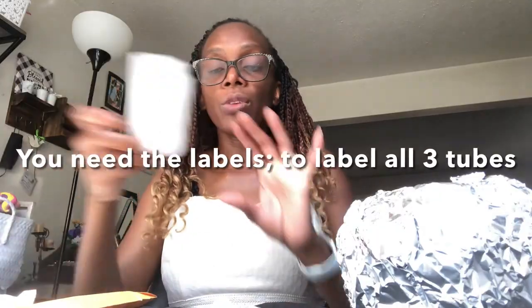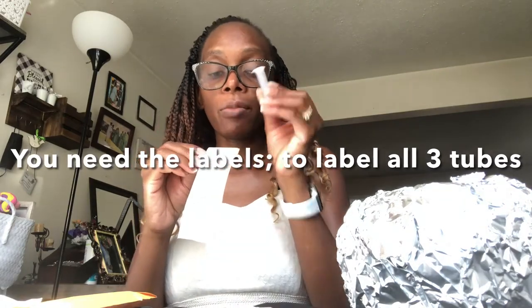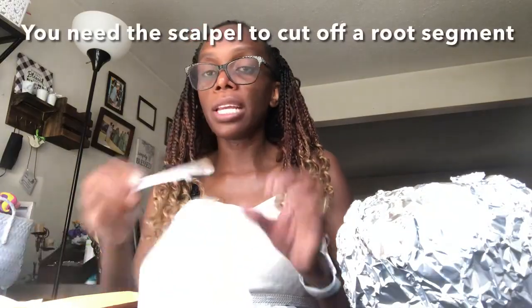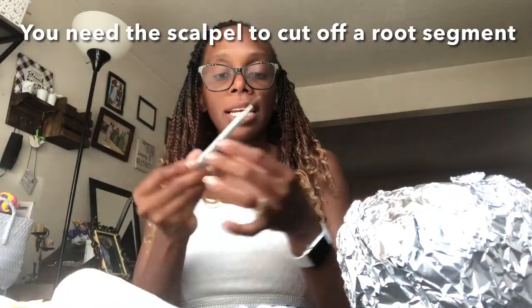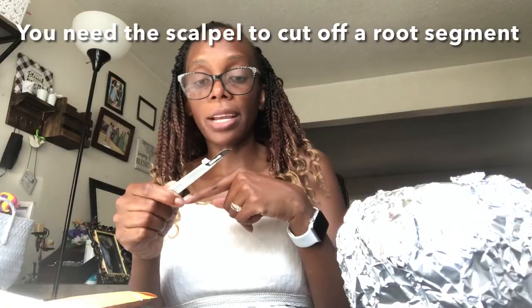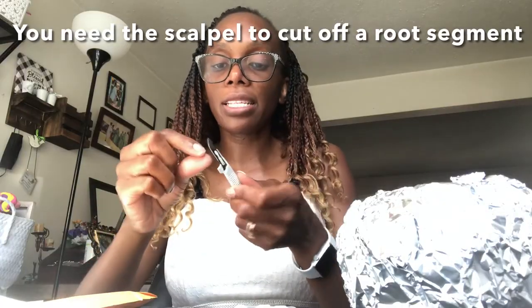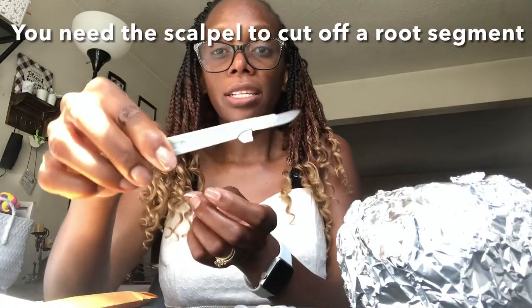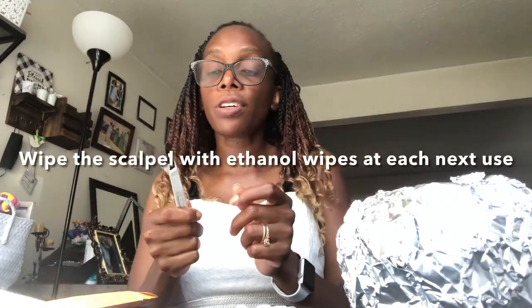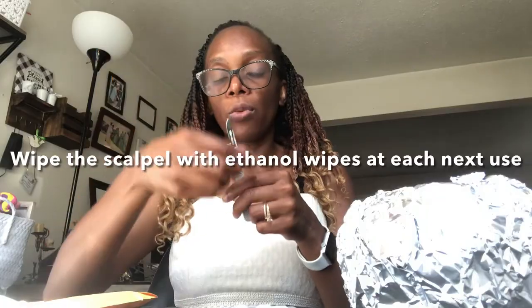We have that, and then you need labels. So today we'll actually label all three, so we keep track of what these are. And then you will need a scalpel. This one comes sealed. I unsealed mine yesterday when we started doing an experiment. If yours is still sealed, take it out of the package, and then take off the plastic clip so that the blade is exposed. Okay, and once you use it for the first time, the next time you use it, please use your wipes to wipe the whole scalpel.